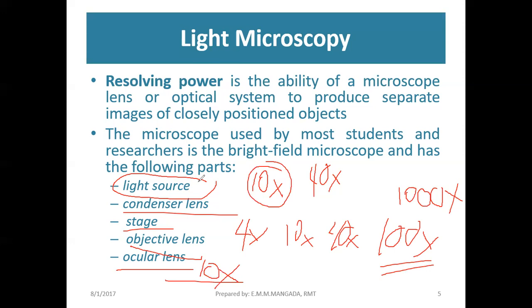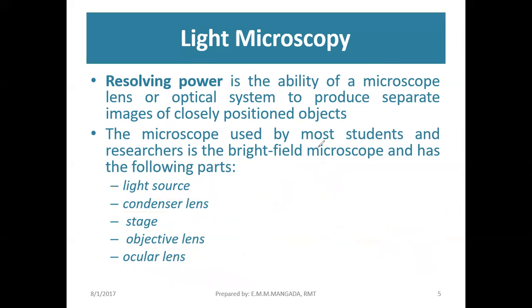So, sa e-learning natin, we will have a microscopy simulation. You will be seeing the link later, so you can access it while listening to this lecture, or if not, you can visit the microscopy simulation section in your online module.